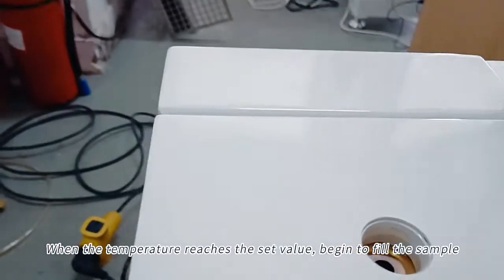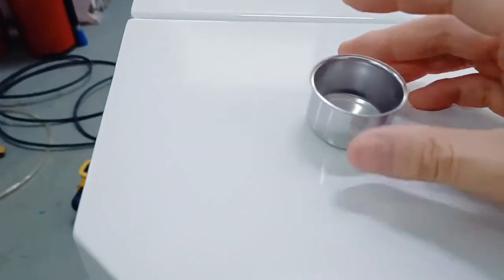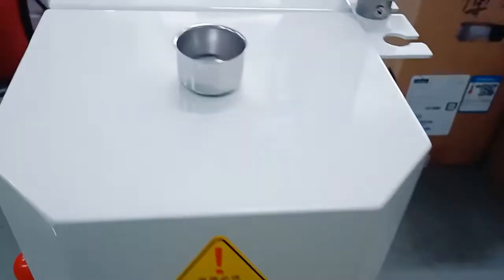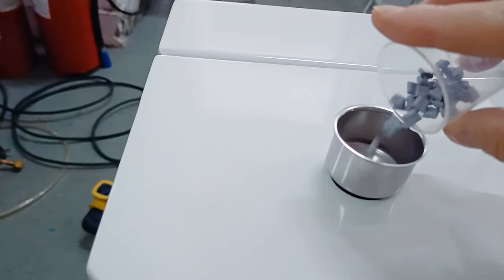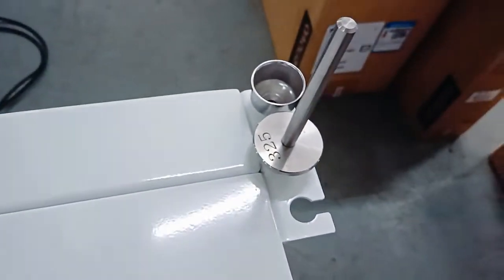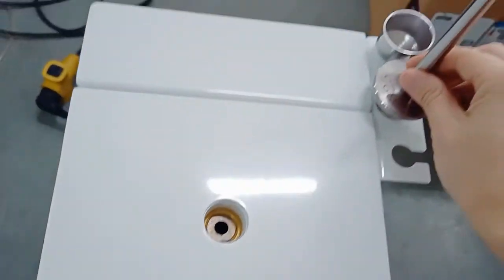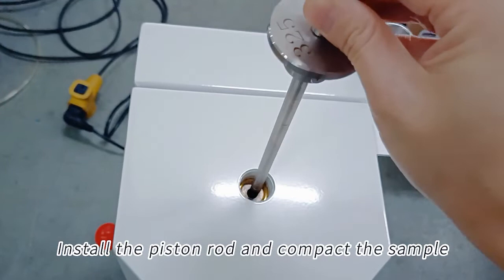When the temperature reaches the set value, begin to fill the sample. Install the piston rod and compact the sample.